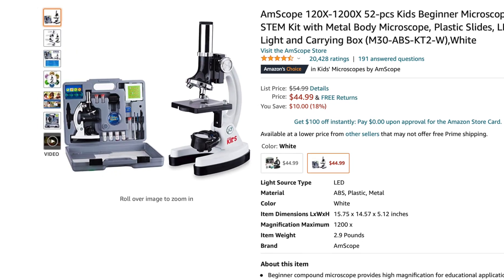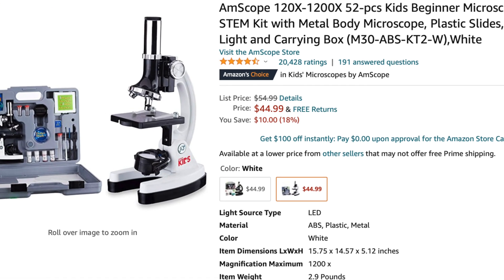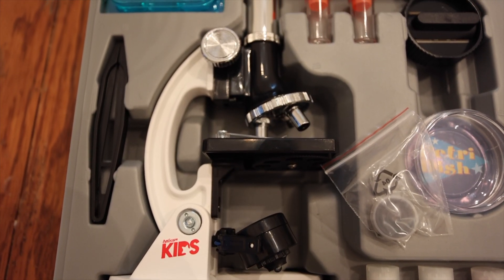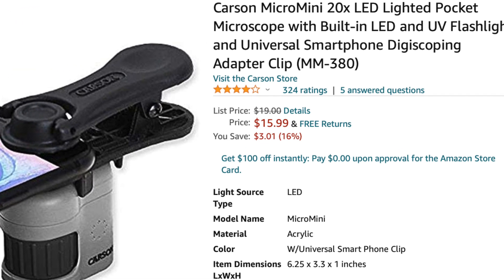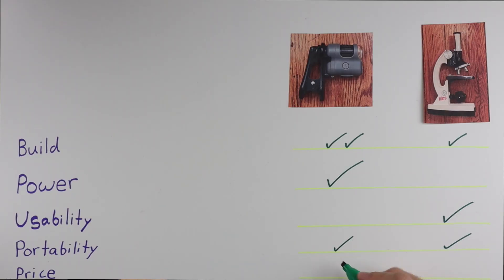Let's talk about price. The Amscope microscope generally retails on Amazon for $54.99, but it's pretty much always on sale, and it comes with many other things to enhance the experience. The Carson Micro Mini retails for $19.99. While the Amscope is more expensive, I'm giving them both a check mark because I think they're both reasonably priced for what you're getting — at $54.99 you're spending more, but you're getting much more as well.